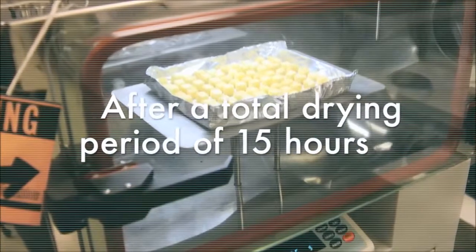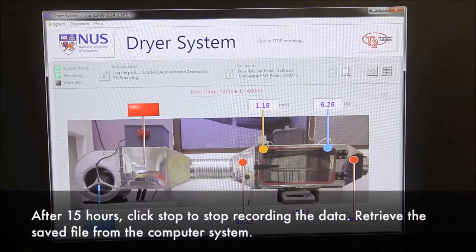After a total drying period of 15 hours, click Stop to stop recording the data. Retrieve the save file from the computer system.